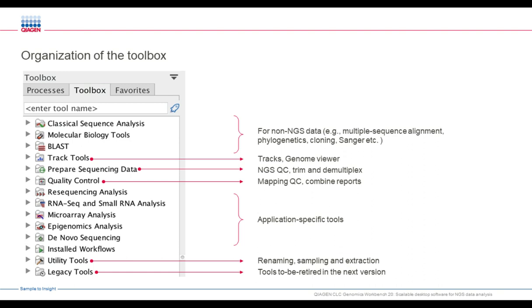Looking at the toolbox, the tools are organized by folders named by the overarching theme. The first few folders are for non-NGS data — for example, multiple sequence alignment, phylogenetics, cloning tools, Sanger sequencing, and so on. The track tools are what one could call a genome browser or genome viewer, with all the accessory tools to work with it. The prepare sequencing data folder contains QC tools for NGS, trimming tools, and demultiplexing facilities.